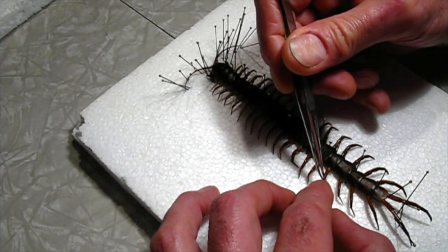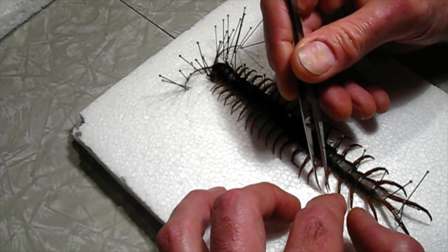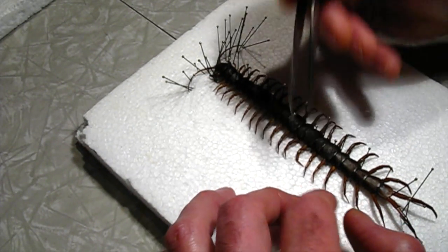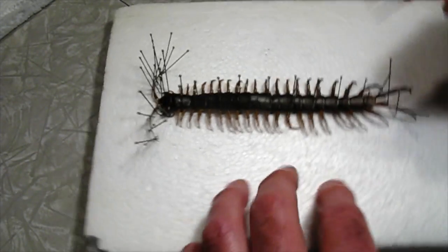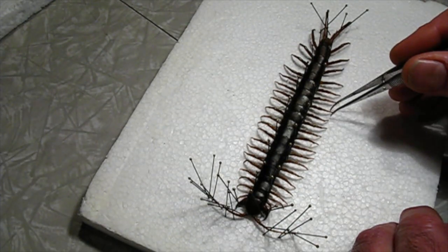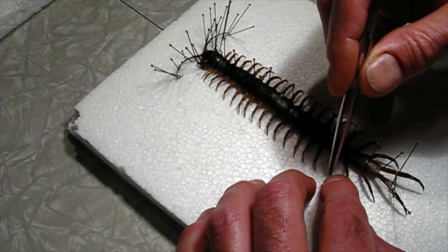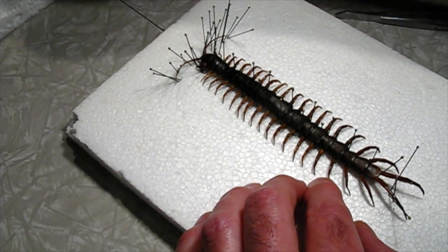I find it's always best if I can to put a little brace in there, a section of pin or a piece of wood or something, just to give it a little bit more for the adhesive to grab onto. And you have to anticipate that these things might be around for a long time, so if you do a good job of preparing them, they'll last a lot longer. Use a few more pins to brace these legs here.